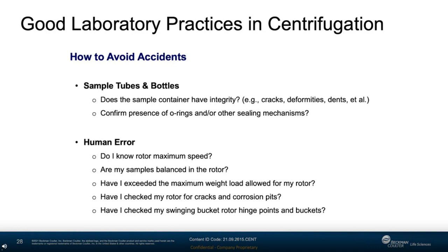On many research lab protocols, the centrifugation step is just this short one-line instruction, and I think that gives the false impression that the centrifuge step is going to be quick.